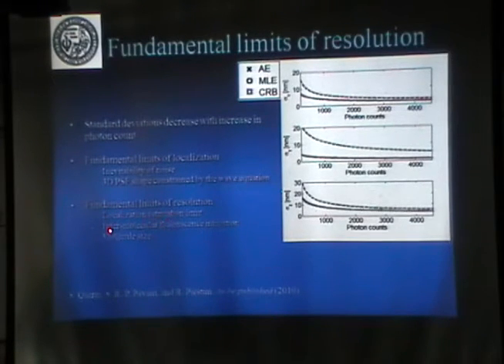There is also an interaction between the molecules. Think of them like dipoles. If you put 2 antennas close by, they're going to interact, and so there are other problems when you get too close. So the size of the molecules and the interaction between the molecules are further limits. We are still limited by the photon count, but soon we are going to be limited by these other problems.